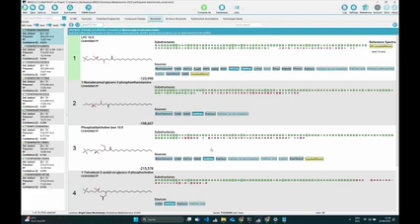if you do the preprocessing in SIRIUS, or if you can provide the data in a format where different adduct species are grouped together, then, because usually for small molecules the single charged ion is the most intense anyway and you usually also get the best spectrum out of it, you can annotate the single charged ion and propagate the results to the multiple charged ones. With future UI updates, there will be the possibility to see the groups, but this is nothing that will be in the next version.